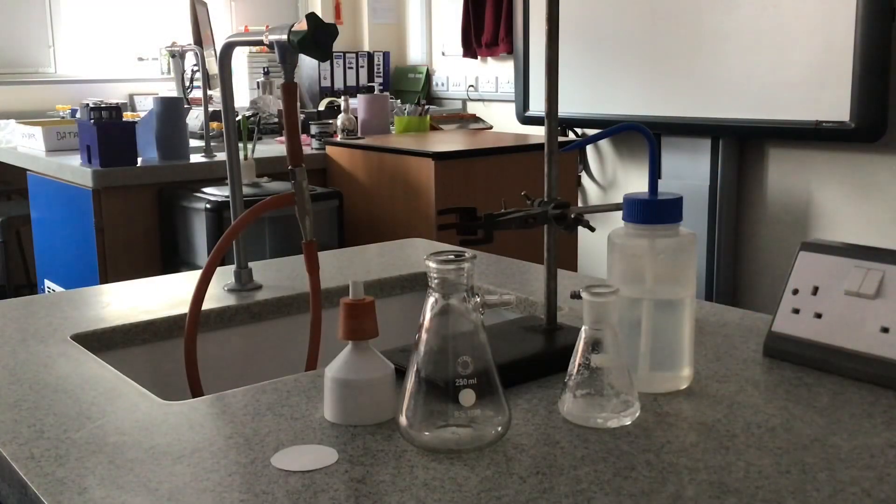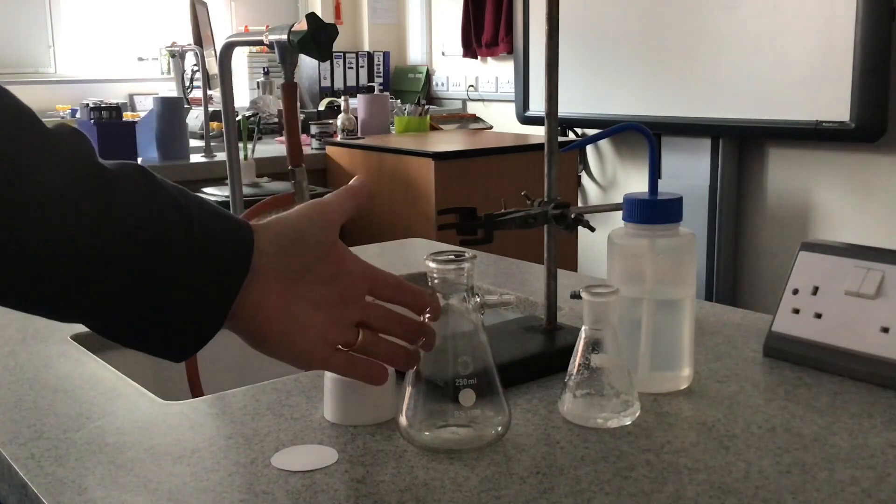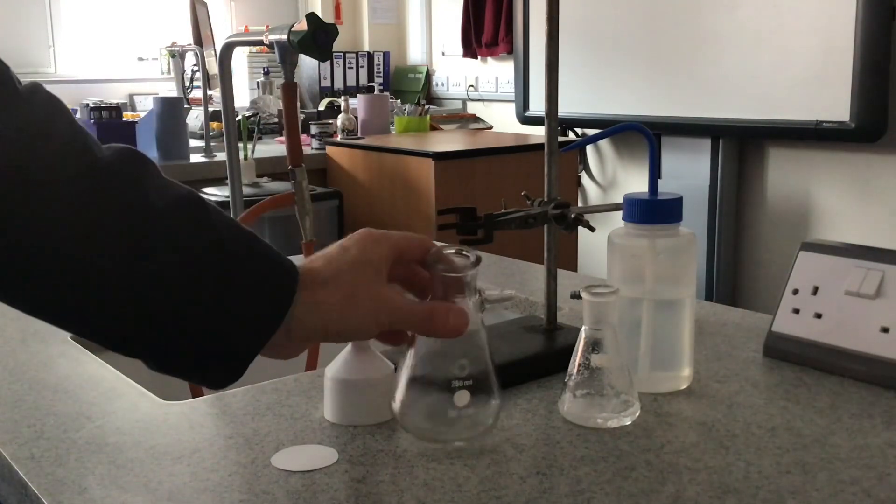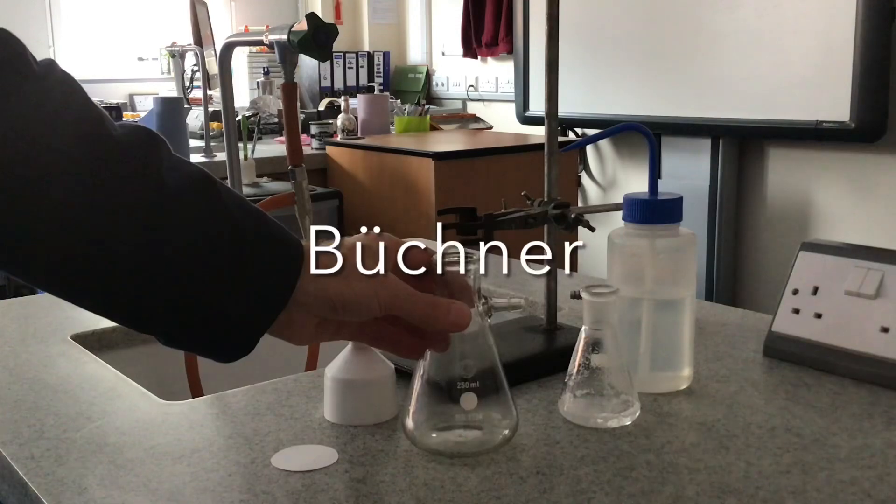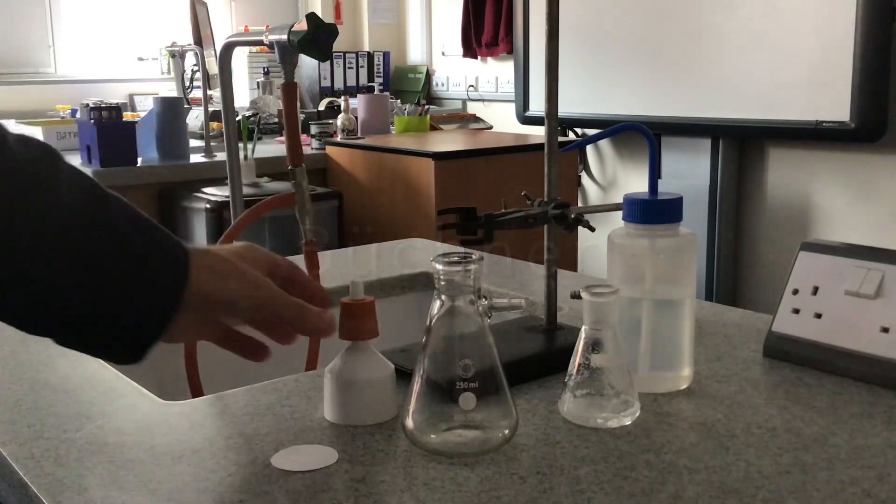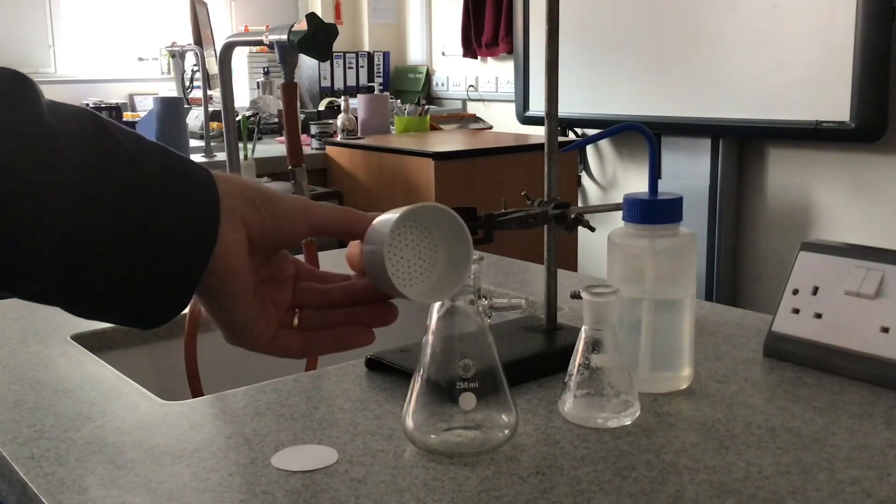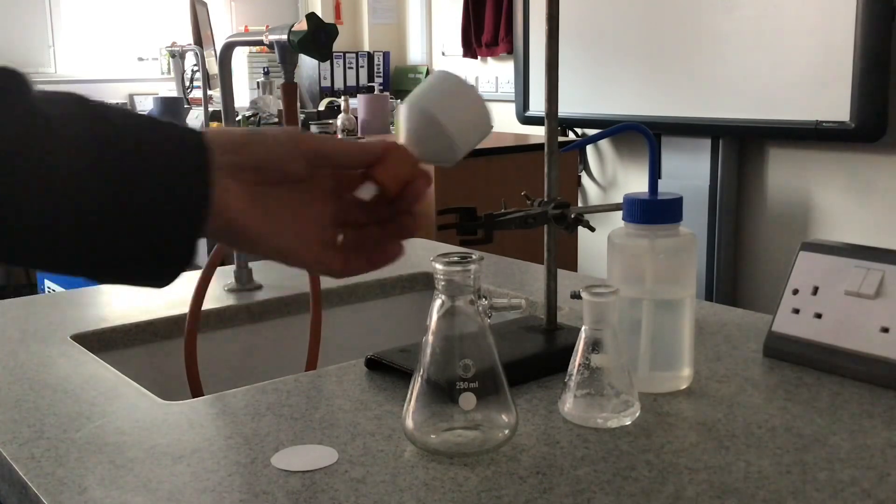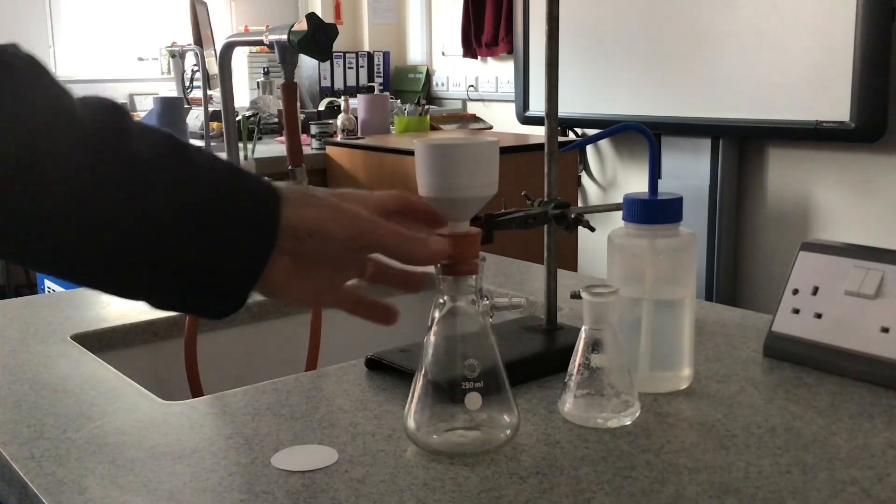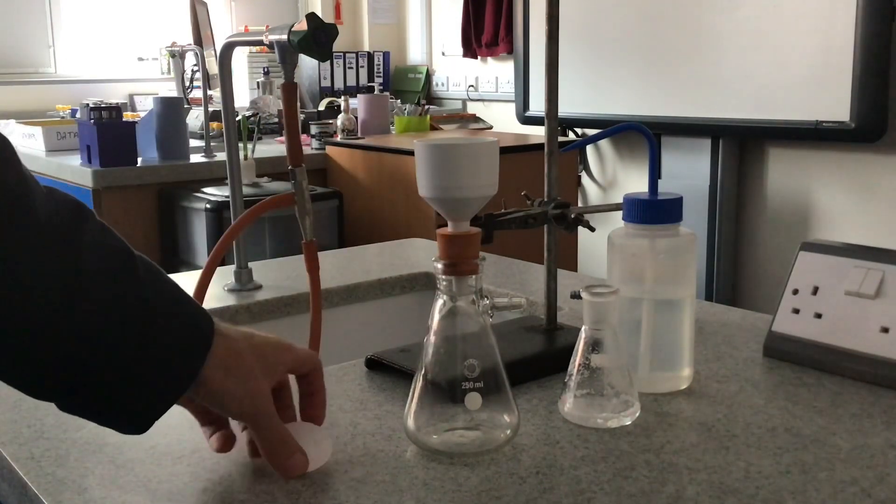In terms of equipment, we've got this conical flask here with a side arm. It's made from very thick glass. This is called a Buchner flask. We've got this filter funnel here, this is called a Buchner funnel. That's going to sit in there like that, and we've got the correct size.